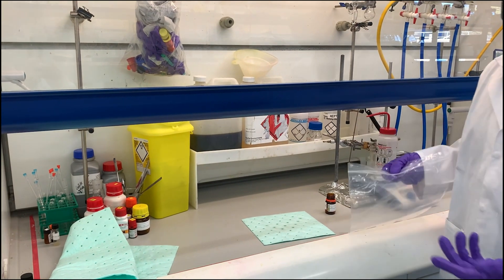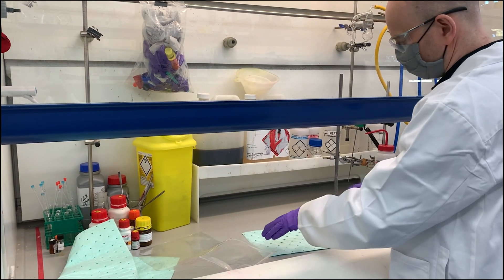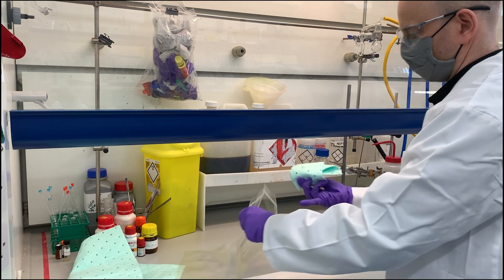All of this work must be carried out inside the fume hood. You can then just bag up any of the matting that you've used, and make sure to wipe up any residue that's left over.